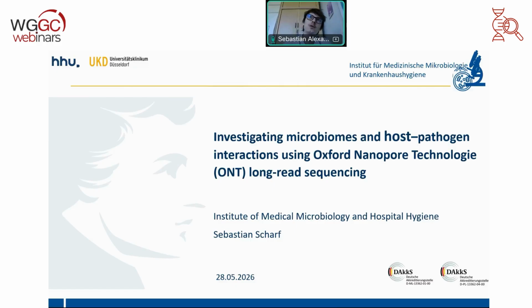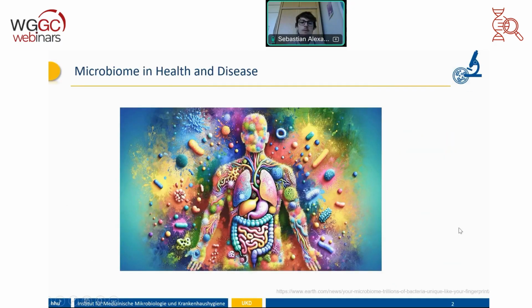Today I will present you 3 different research topics we worked on in the last years, and all of them were for investigation of microbiomes and host-pathogen interactions, where we used nanopore sequencing technology. First I will speak about the microbiome in health and disease.